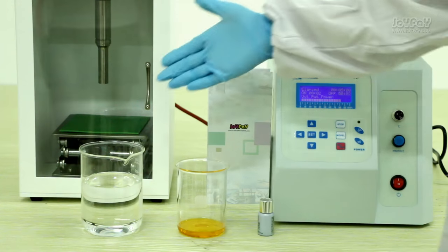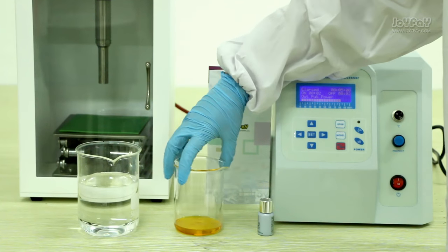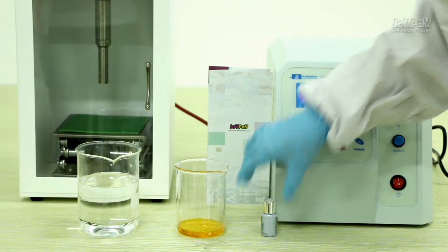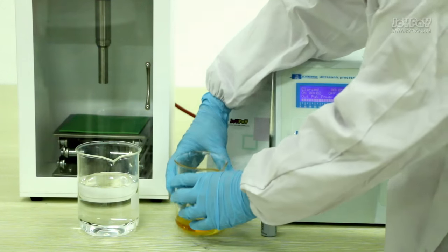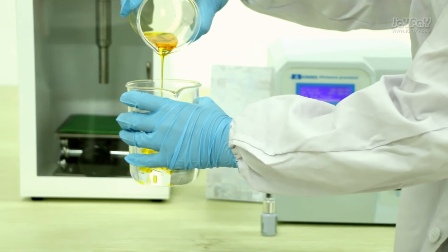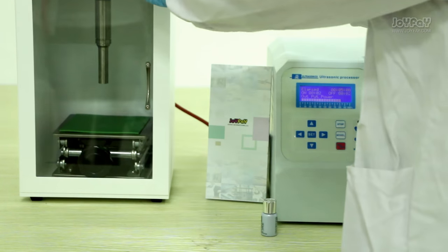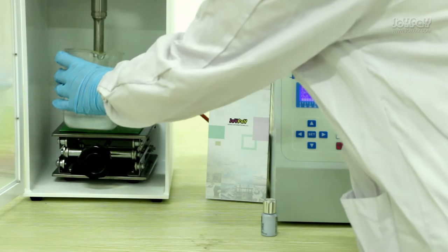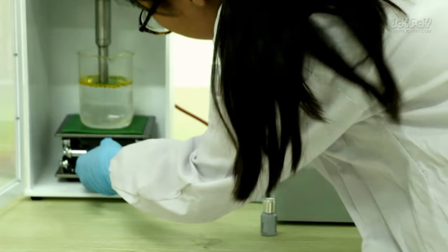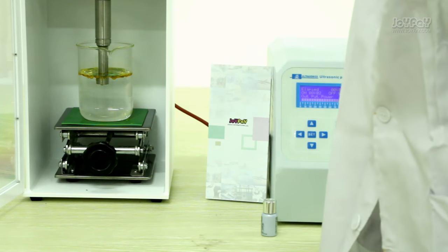Now I will show you the process of mixing water with oil. Here is the water, and here is the oil. Pour the oil into the water. Put the beaker on the lifting platform. Adjust the height of the lifting platform, and immerse the probe into the liquid for about 1 cm.